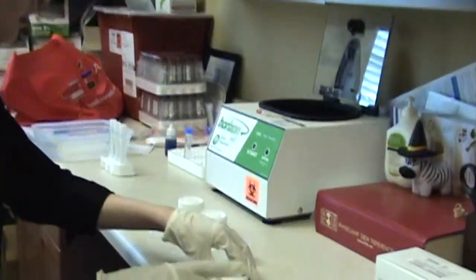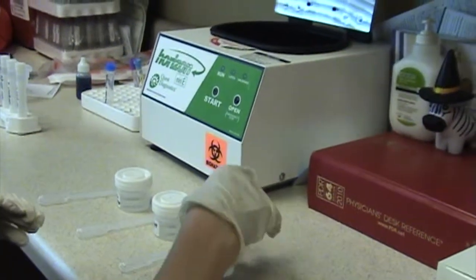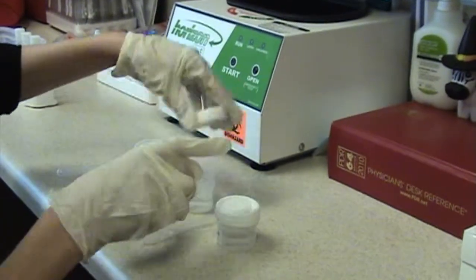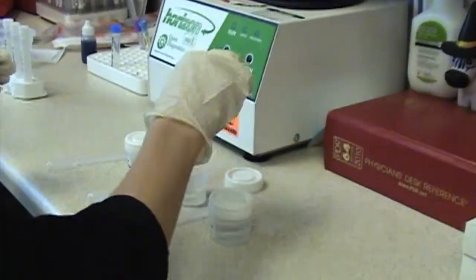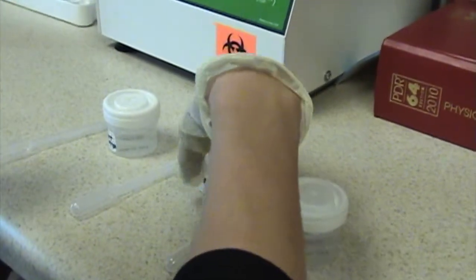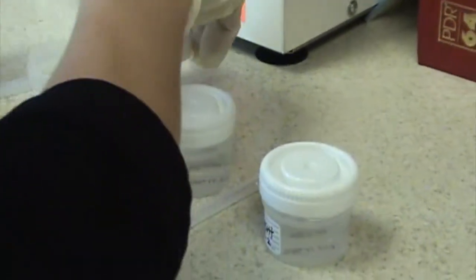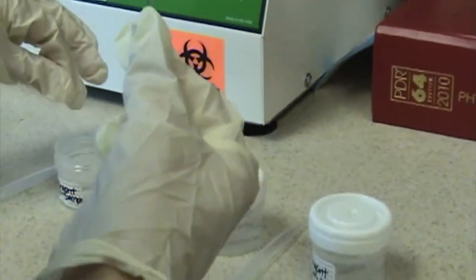I have just arrived back at the lab with the hair samples. I will now place each hair sample in a detergent in order to extract the DNA from the cells. Suspect 2 hair. Suspect 1. And the hair found in the hand.